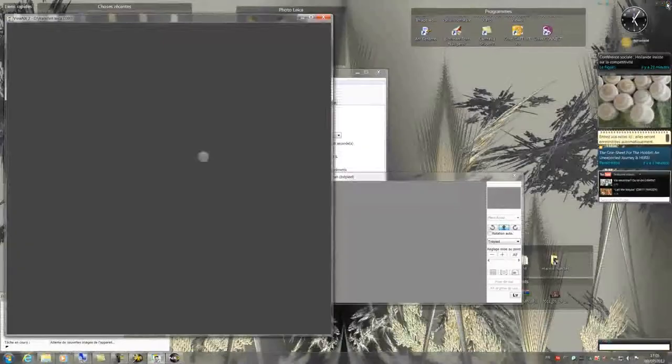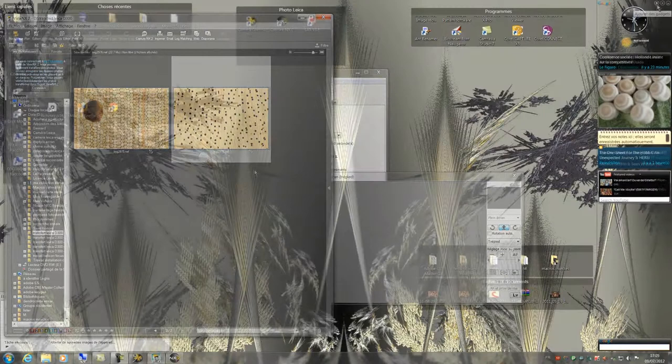To allow you to assimilate the different steps of shooting, we shoot a new sample. So I put a new sample under the macro zoom.